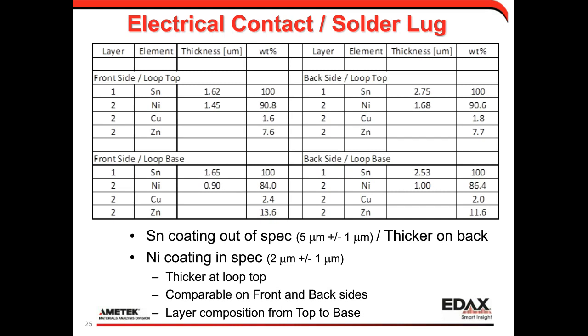So this was just to give you an example of what you can do with benchtop equipment, looking at, say, electrical layers at a typical component. And maybe there's something about this analysis that says why the part works or why the part is not working in a particular function.